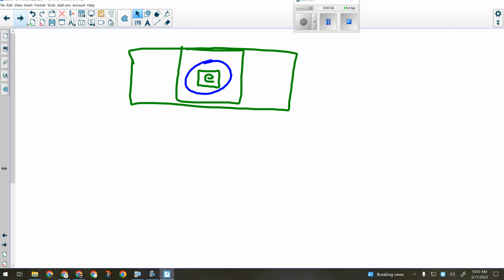In the end, our wet mount is going to end up looking like this. The big rectangle here, that's the slide, a rectangular piece of glass. On there is going to be a letter E cut out of an article, just a letter E, placed on the microscope slide. Then you're going to put a drop of water, that's the blue circle, and then you're going to put a cover slip, which is a small, transparent, square piece of plastic.